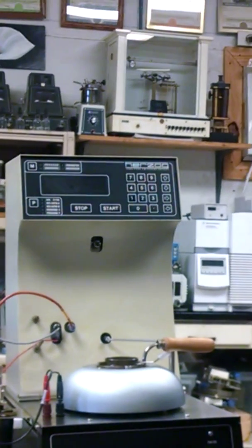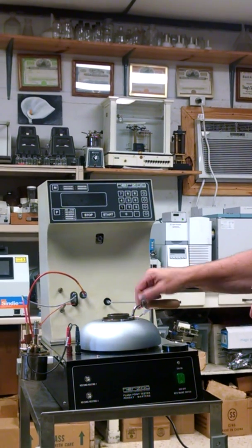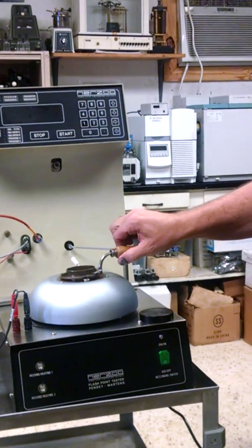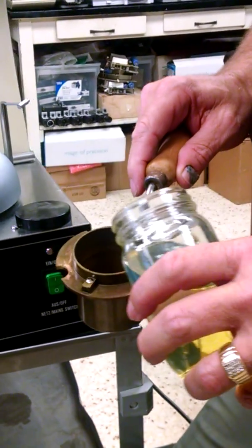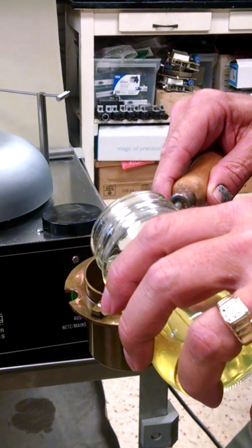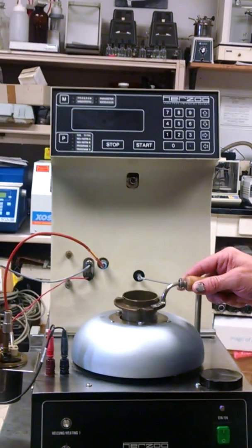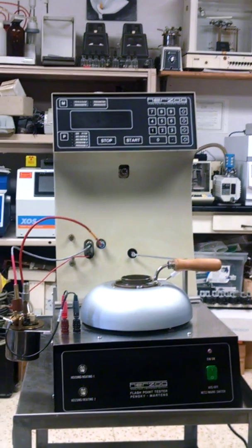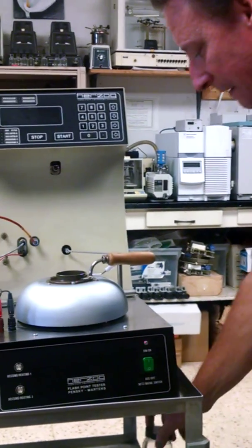First thing we're going to do is a flash test on diesel. We've got a little bit of diesel here. We're going to take the cup out. It's got a little lock right here. You unlock the cup and pull it out. If you can see, there's a little line in there. So what you want to do is fill your diesel up to that line. Then you put your diesel sample in the flash cup, lock it down, put the lid back on the diesel sample, and put it out of the way.